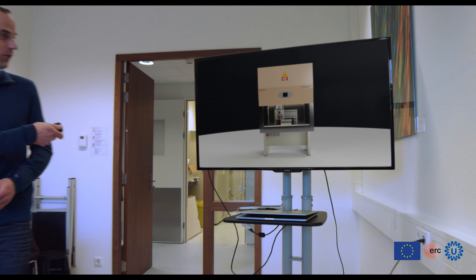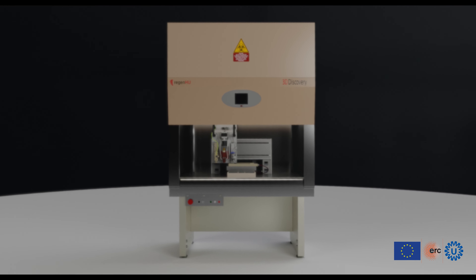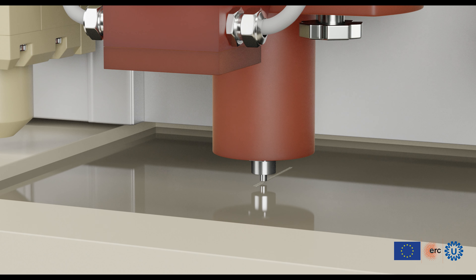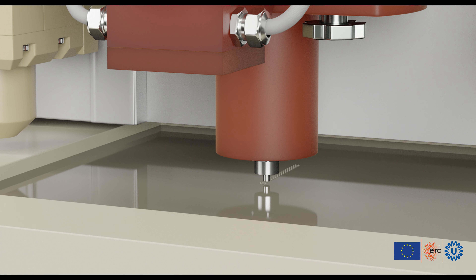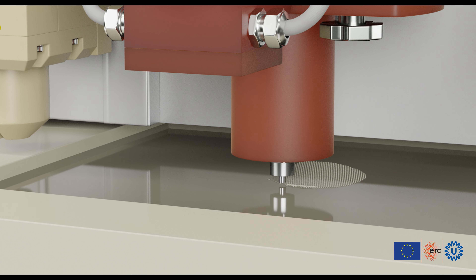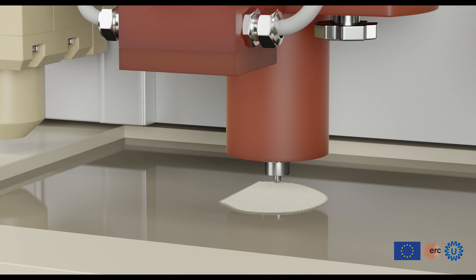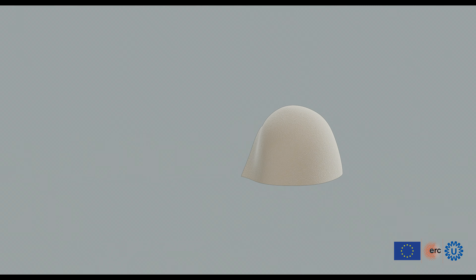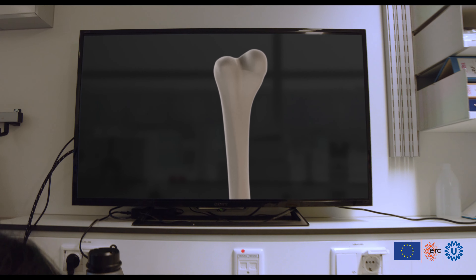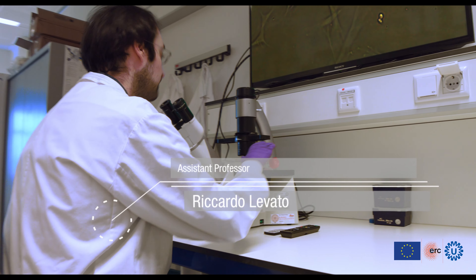Biofabrication works by assembling and printing living cells and bioactive materials in an automated fashion. With 3D printing, we replicate a CAD design which can be derived from CT or MRI scans of a patient, and create a 3D living object replicating the architecture of the cartilage and bone in the joint.